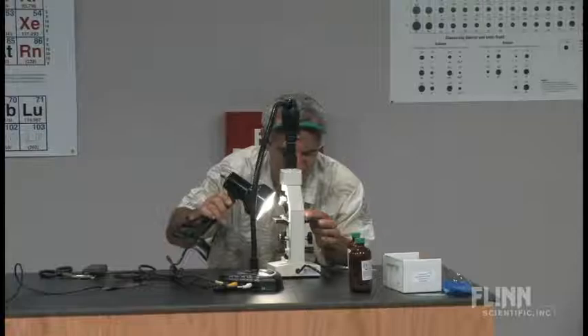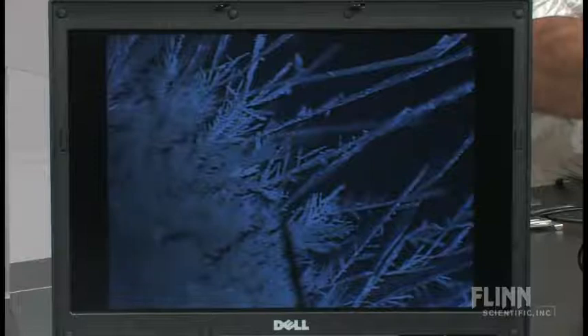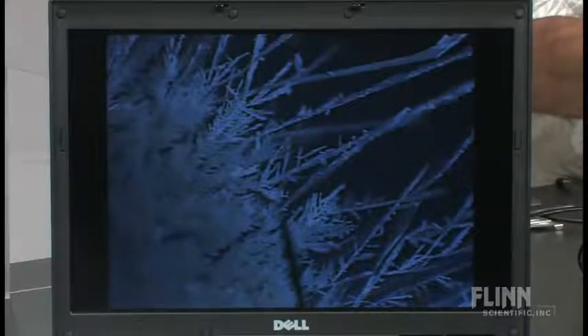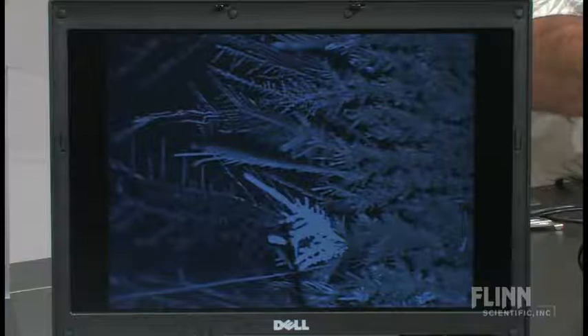The chemistry is pretty simple: copper plus silver ions forms silver plus copper ions. There's a nice one — see that one reflecting the light? It's still growing. Probably the smallest demonstration I do, but I think one of the more beautiful ones — a nice little electrochemistry demonstration for the holiday season.